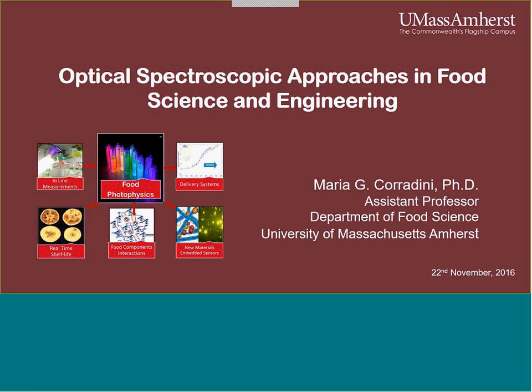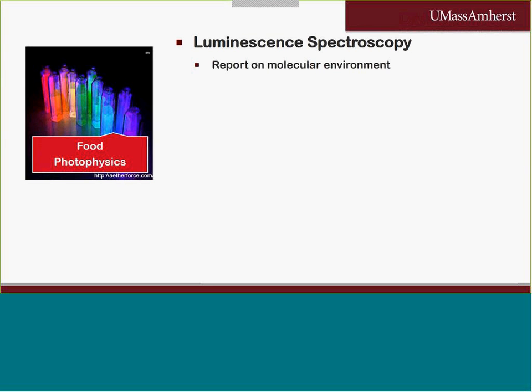What is luminescence spectroscopy? One of the main advantages of luminescence spectroscopy is that it can report at the molecular level. Basically, it reports on the molecular environment.